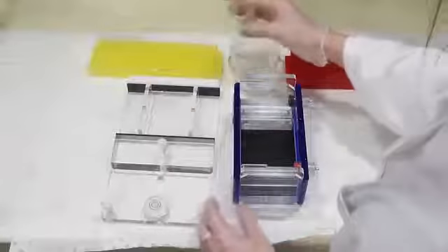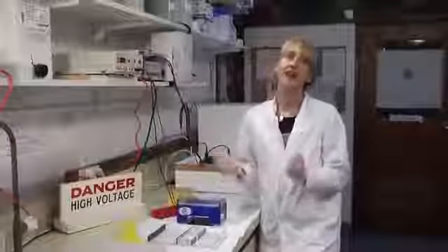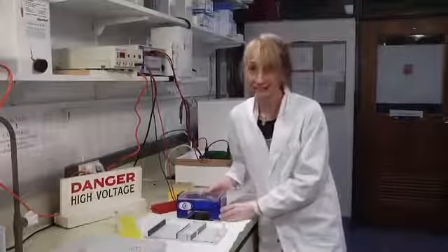So I've set up a restriction digest for each of our plasmids that we extracted earlier. To visualise the DNA in our cut up plasmids and check whether we've got the insert, we need to run a gel. So now that our fragments have separated, at last we can go and have a look which one of our plasmids actually contains the insert.